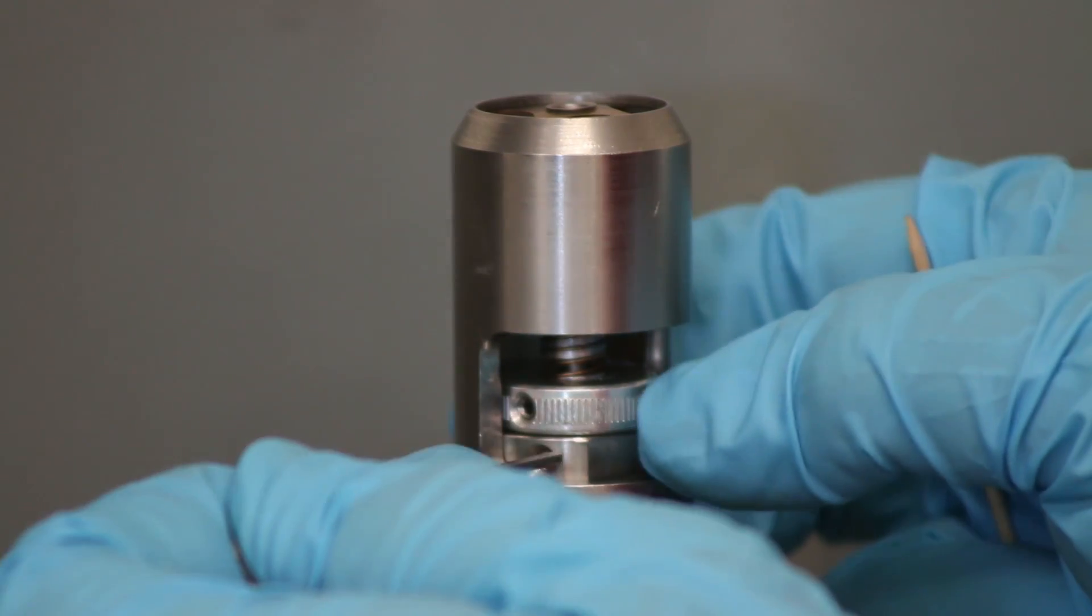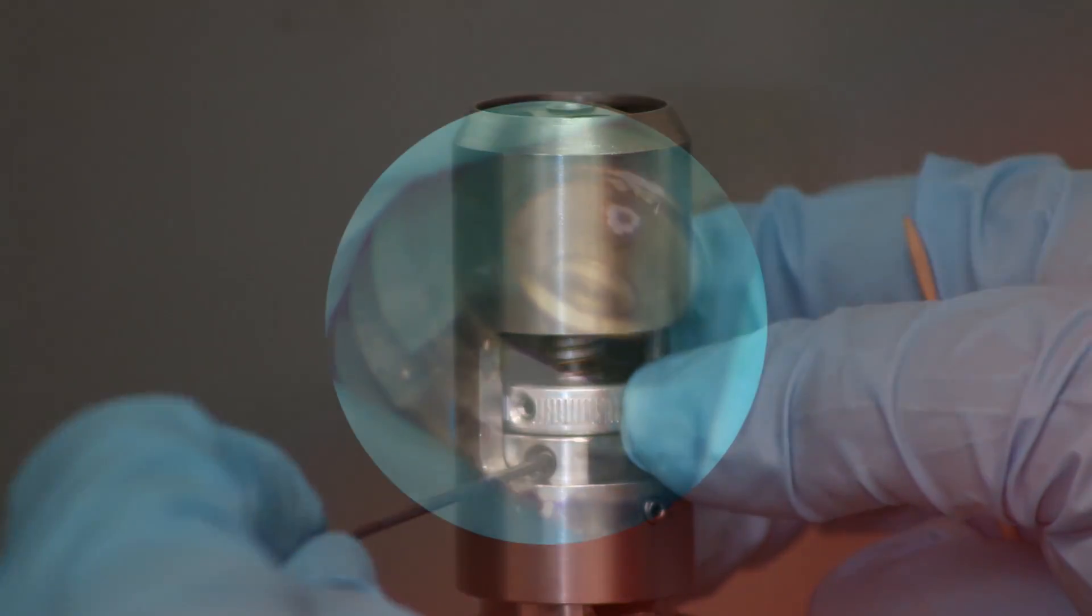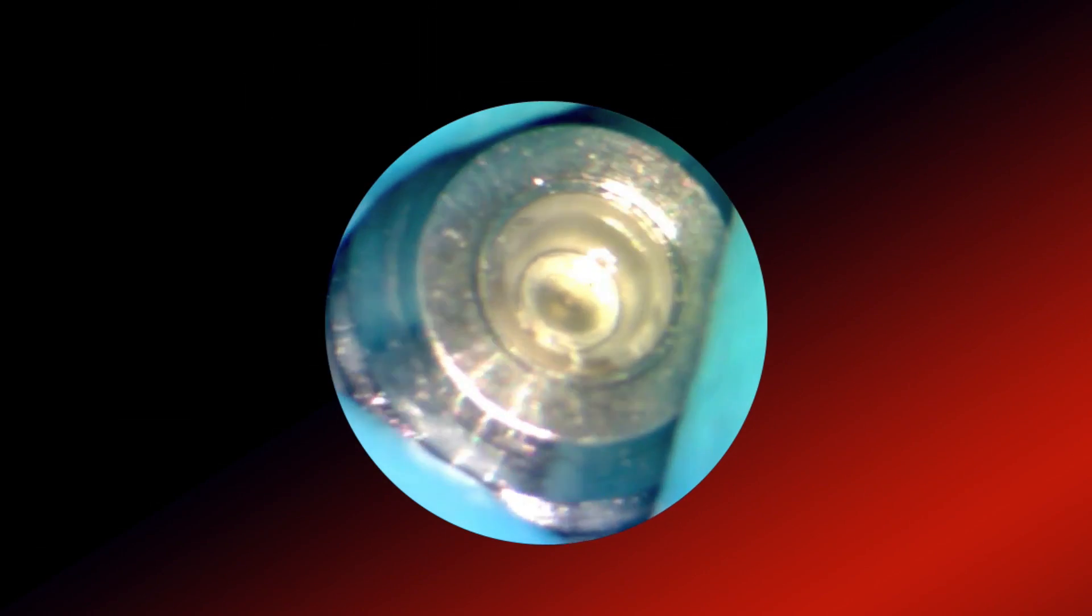The rheometer uses a magnetic sensor to detect the motion of a jewel-mounted torsion assembly in the test cell.